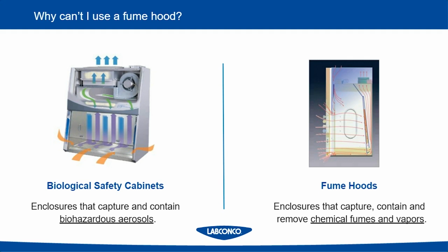The reason that we have these two very different types of hoods is that you never would want to handle a virus or a particulate in a fume hood, because fume hoods don't have any type of filtration built into them. They typically carry all the fumes and vapors right out an exhaust stack into the environment. We do not want to do this with biohazards. You always want to make sure biohazards are trapped in some kind of HEPA filtered enclosure, and that's the kind of thing we can get from a biosafety cabinet. We'll talk more about biosafety cabinets later in the presentation.